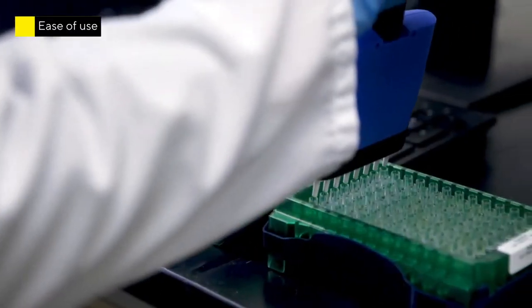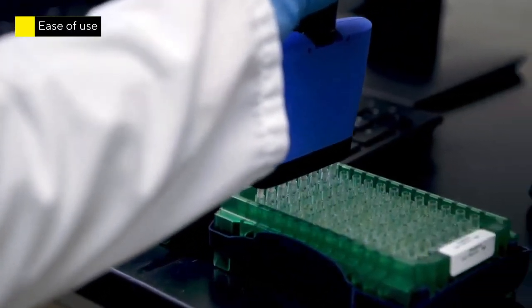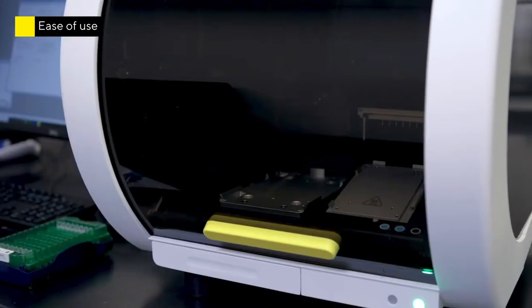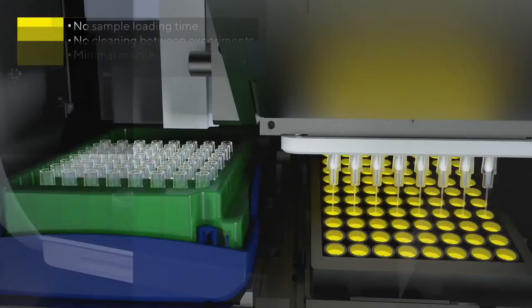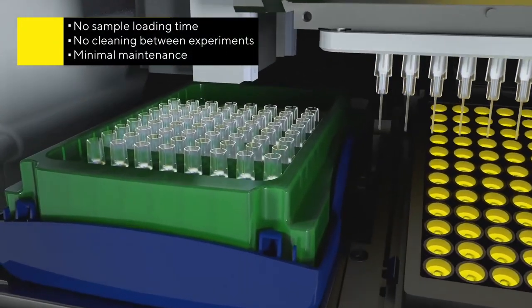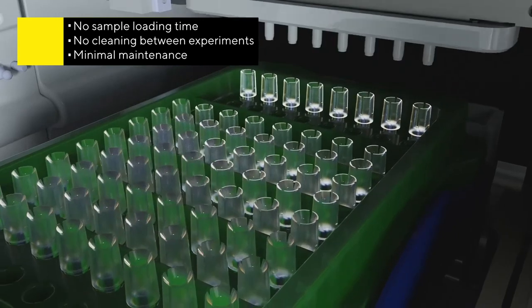In addition, BLI is easy to use, making assay development and optimization a much faster process for a shorter time to results. This fluidic-free approach eliminates sample loading or cleaning steps between measurements.